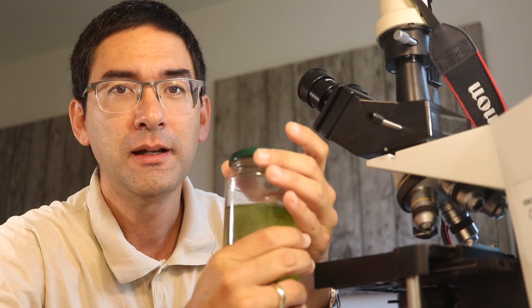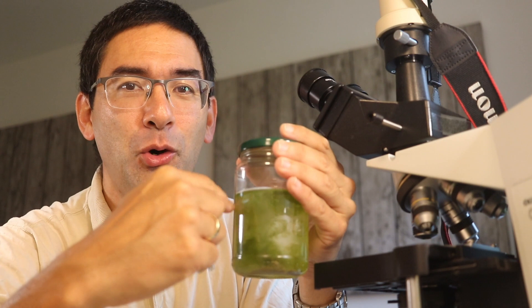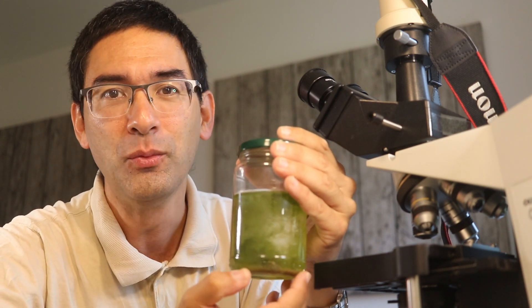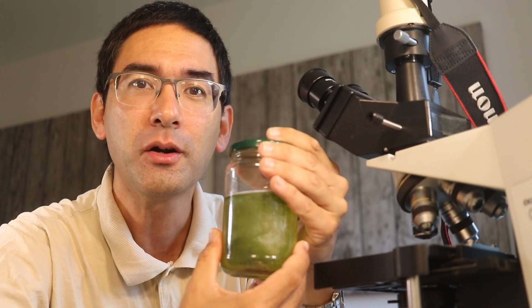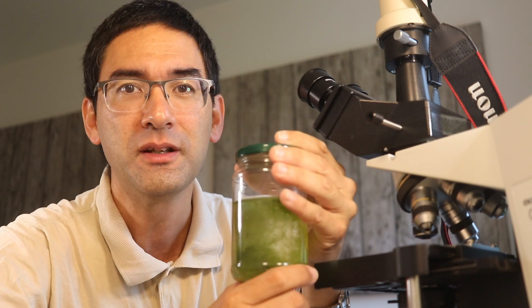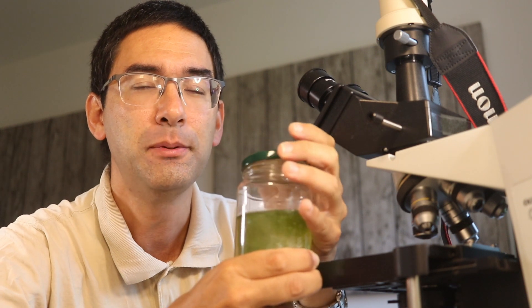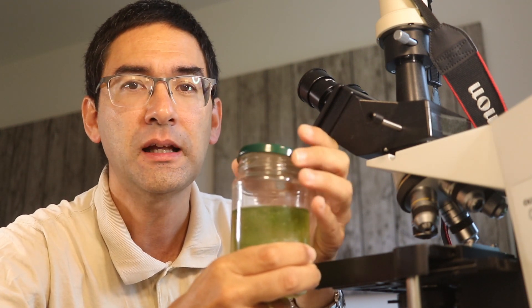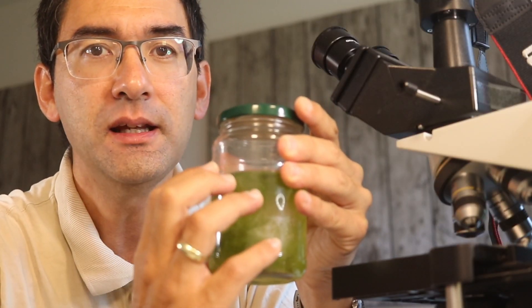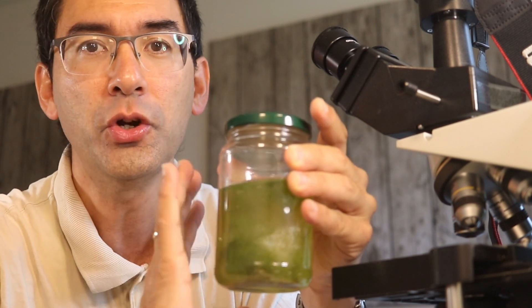What about completely closing the lid? If you do that, you create something called a mesocosm, where all nutrients are completely recycled inside. This is somewhat unstable — even aquariums with a larger water volume aren't totally stable; you still have to exchange the water. I would say: keep it open, or at least put the lid on lightly, replenish the water, and make sure the oxygen concentration is high.